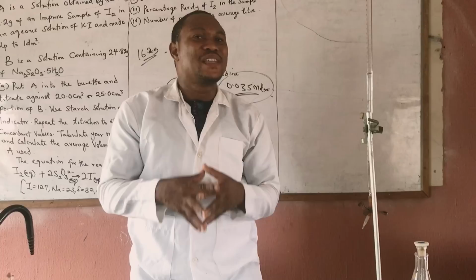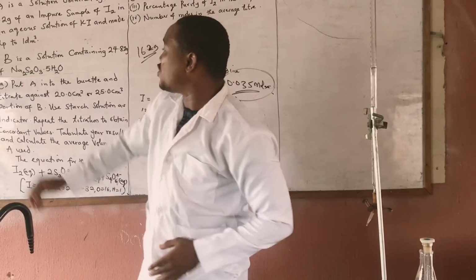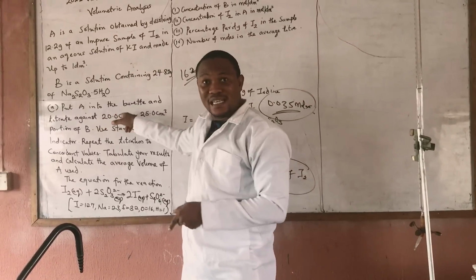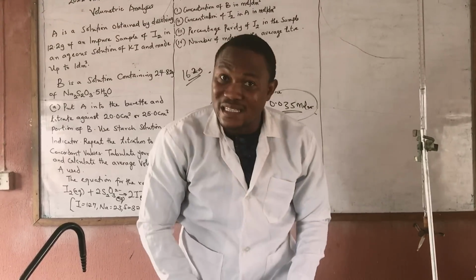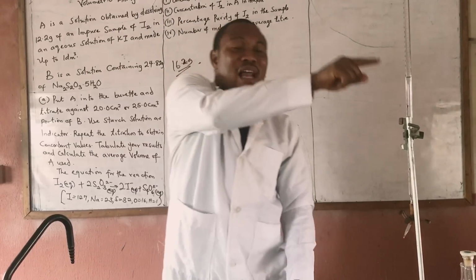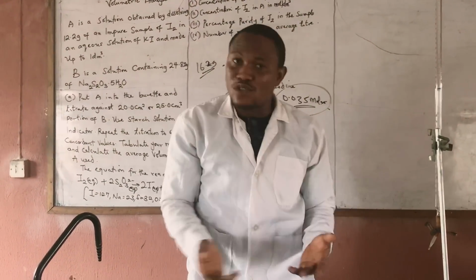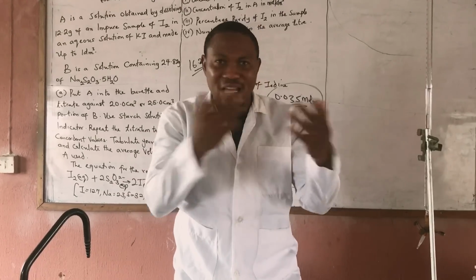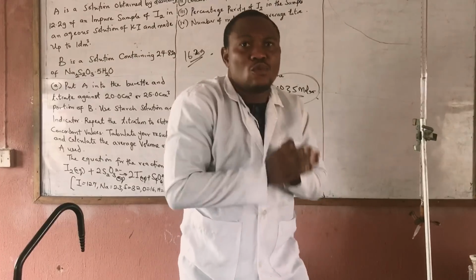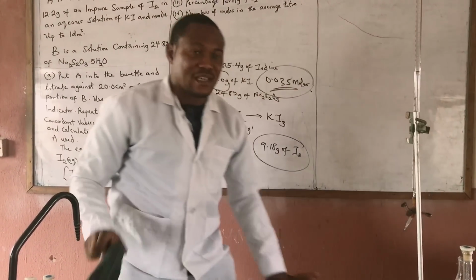So on the day of the exam, read the question and know the one that is supposed to be in the burette. If you see my sample question, I said, here's the solution, put A in the burette. They will instruct you on the one to be in the burette. They might ask you to acidify; the question can come in so many ways. But your own is to read the question and do what they ask you accordingly. I hope that information helps.